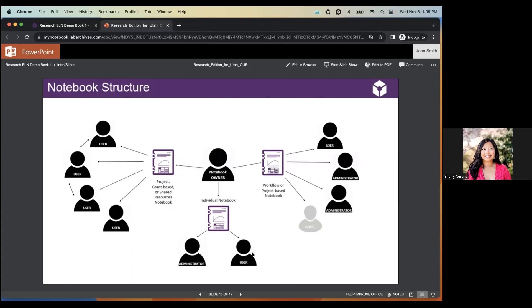In the individual-based notebook structure, each lab member gets their own notebook with one owner, and the designated person is added as an administrator so they can control view and edit rights. In the project-based structure, one notebook is created for a specific project, with each collaborator added as a user. You can also create shared notebooks for lab policies or SOPs and add everyone in the lab as a user.